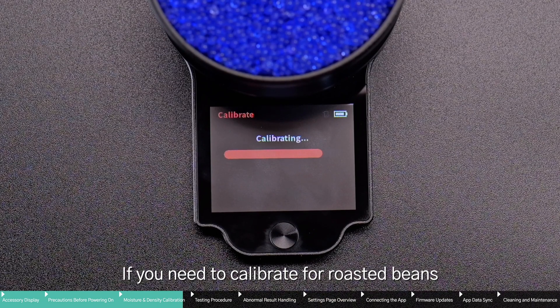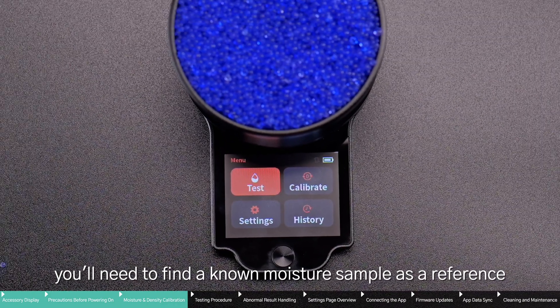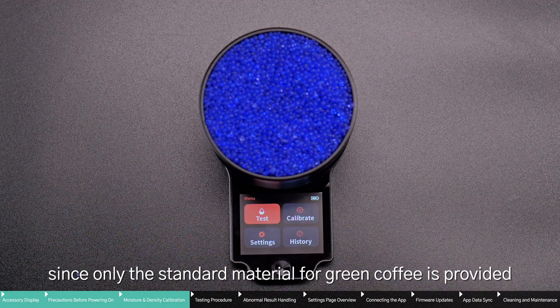If you need to calibrate for roasted beans, parchment coffee, or dried fruit, you'll need to find a known moisture sample as a reference, since only the standard material for green coffee is provided.